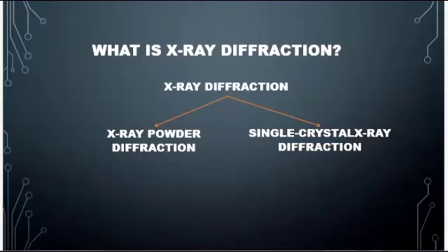Additional uses include detailed characterization of crystalline samples, determination of unit cell dimensions, and quantitative determination of modal amounts of minerals in a sample. X-ray powder diffraction can also be applied to the identification of fine-grained minerals.